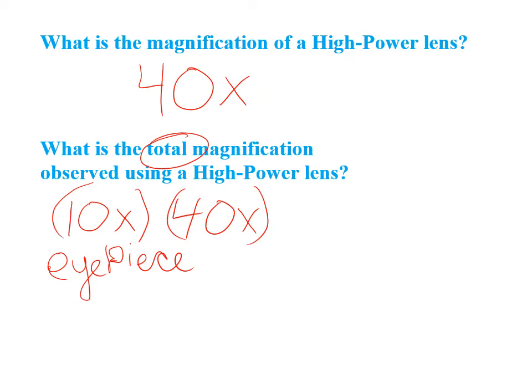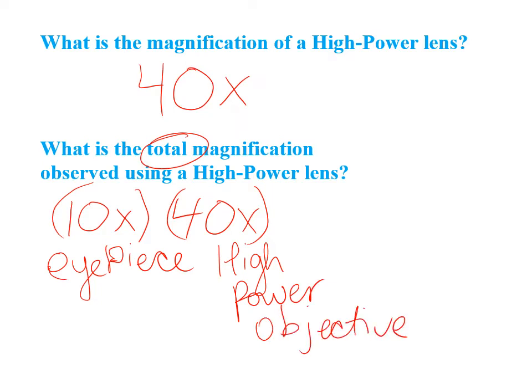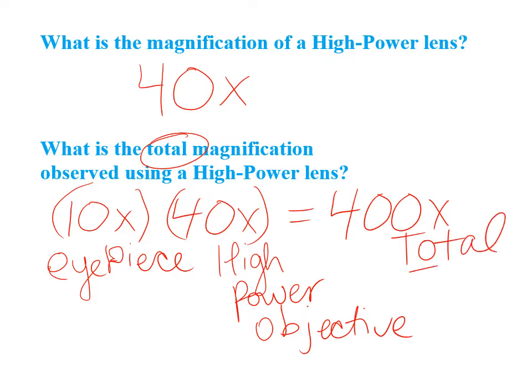Okay, so in this case, the high power objective. So now you have to then give the final answer of 400x total magnification.